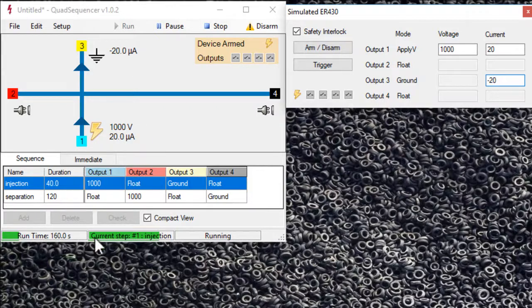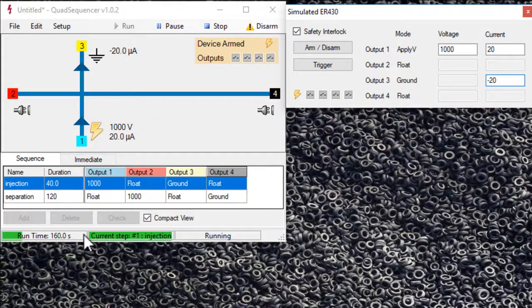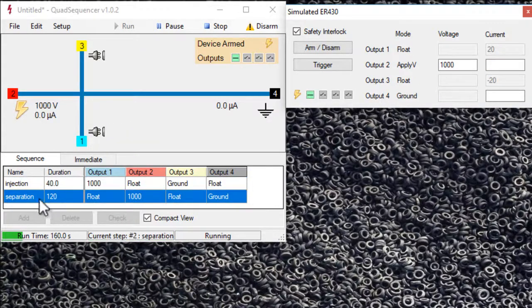It's still doing the injection step. So it's nearly finished. So that's number one, injection. This is the total run. It's just about to swap to the separation step.